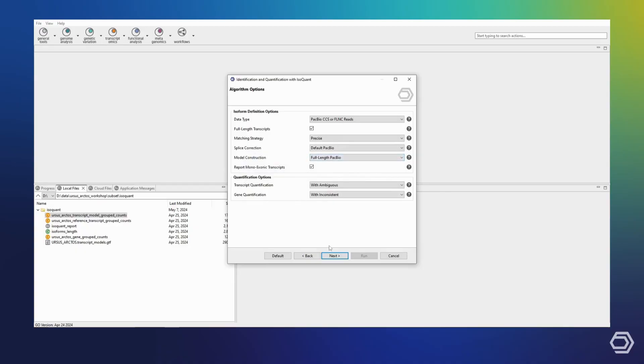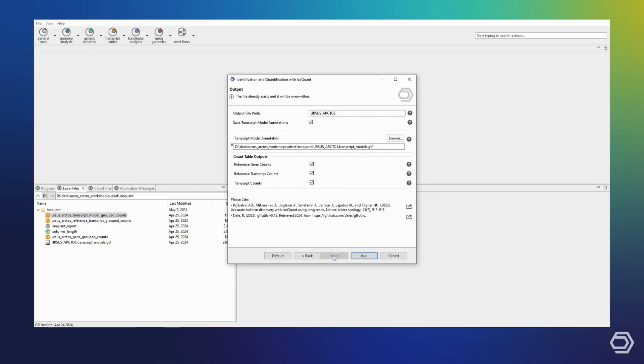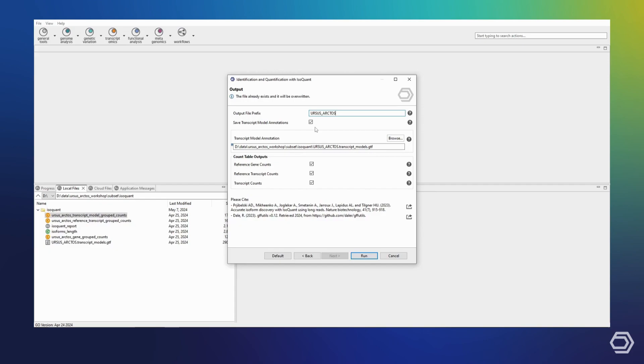On the final page of the wizard, we can select our output options. First of all, we can set a fitting prefix to easily identify our outputs. We can choose to save the transcript model annotations, as defined by IsoQuant, as well as the quantification tables. We can choose to save reference-based quantification on both the gene and transcript level, as well as the transcript level quantification based on the isoforms as identified by IsoQuant.